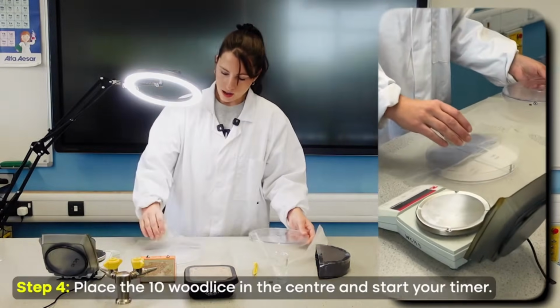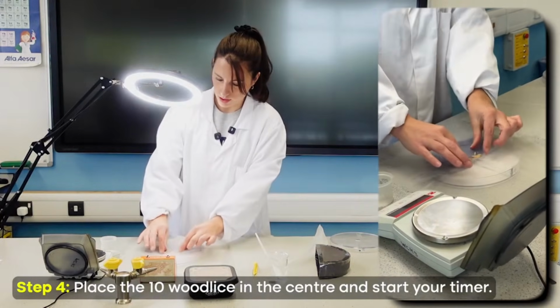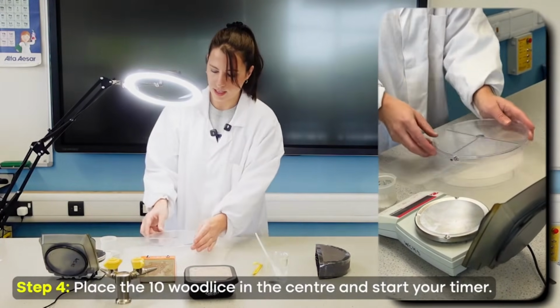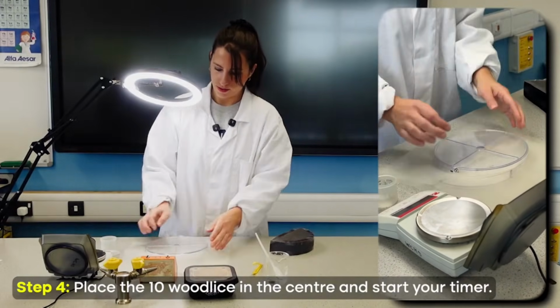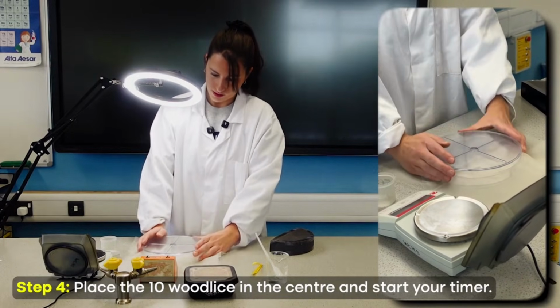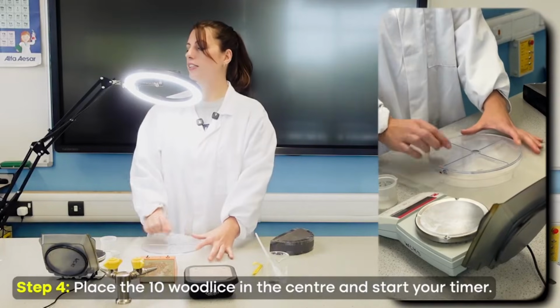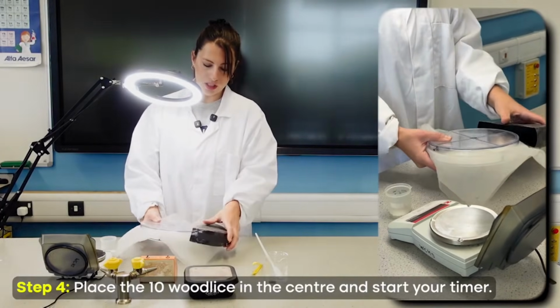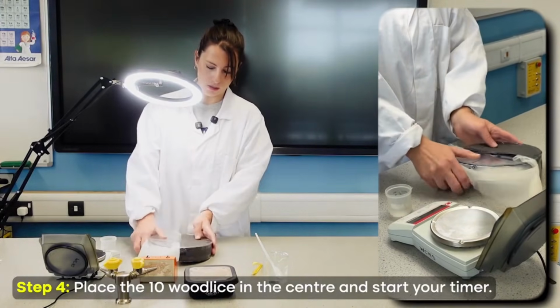Yep. So now I would place them in the middle. You can already see they're starting to move. Place that on top so they can't escape. It is going to be tricky for the students. Now, the idea of this hole is you could actually just put them in there straight away. So you can see mine are already moving before I'm actually ready. But if you do that, you then can't put the mesh, but it's your decision which option you go for.